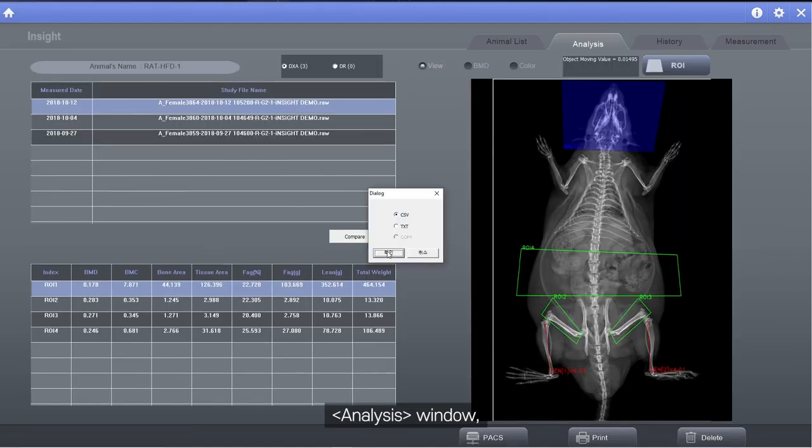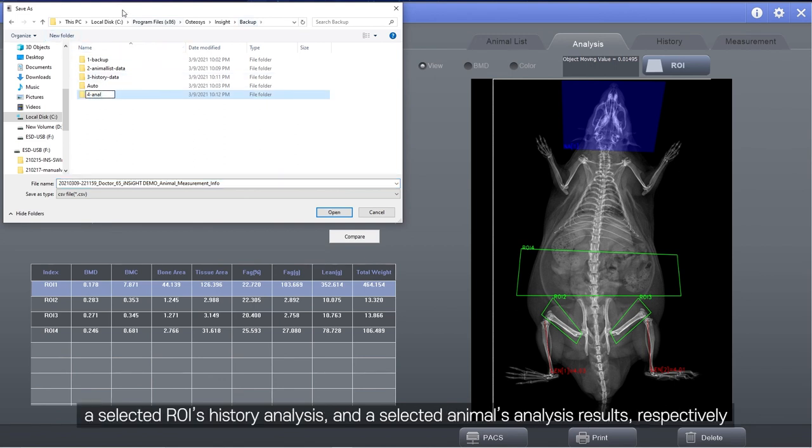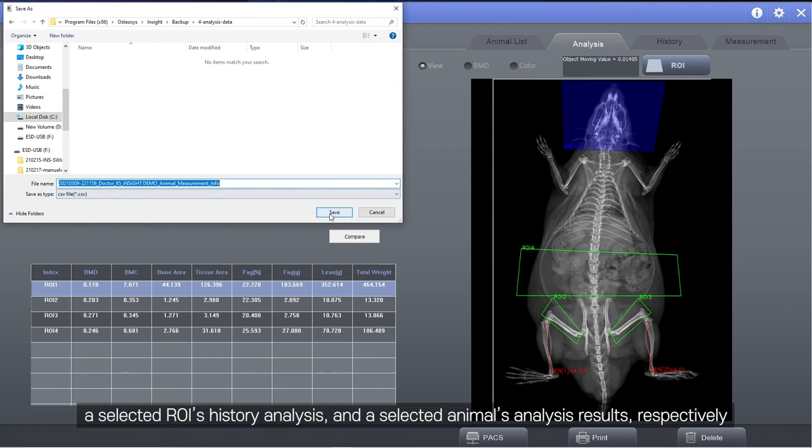Analysis window, and then you can save a selected doctor's measurements, a selected ROI's history analysis, and a selected animal's analysis results, respectively.